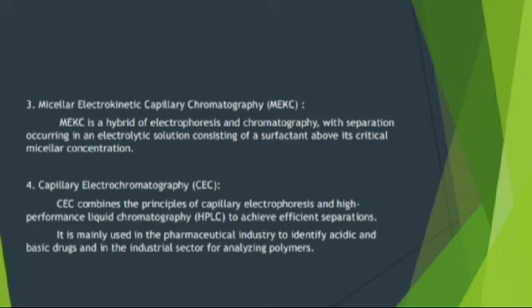Next type is micellar electrokinetic capillary chromatography. It is a hybrid of electrophoresis and chromatography, with separation occurring in an electrolytic solution consisting of surfactant above its critical micellar concentration. Next type is capillary electrochromatography.